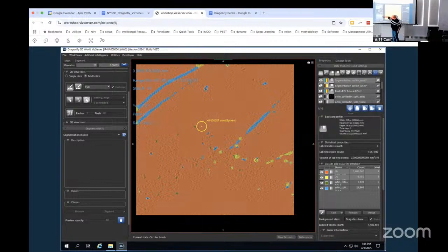You can see this is A and B. And if you toggle between control and shift, you'll see that the color changes between the two classes that you've selected. All it will do is swap those two classes. So if you went over blue right now, it wouldn't do anything. Good point, though.